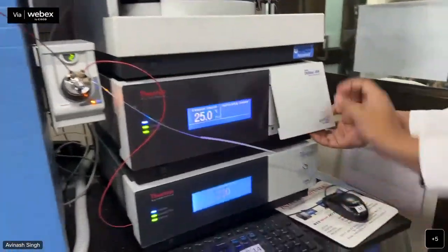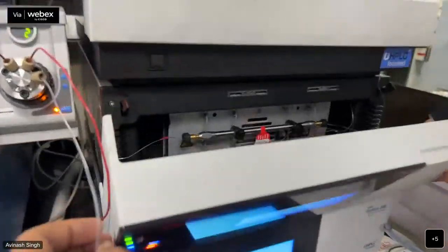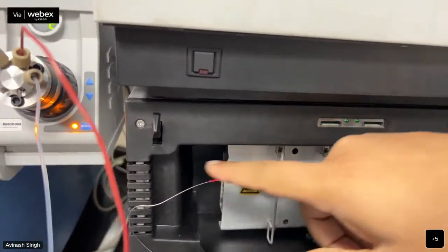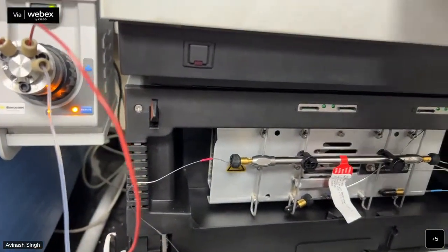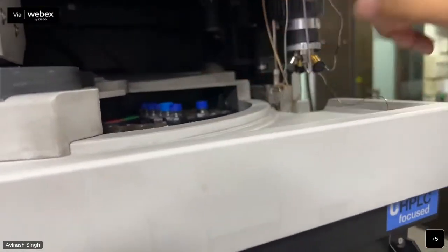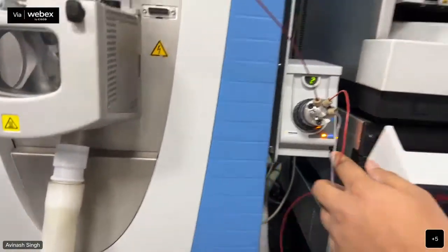So here you can see the column, the analytical column, where the sample is passing. All the sample is passing through this compartment and then going through the tubing to the next compartment. There are different tubings which take the sample from these vials, and from this tubing it goes to the column, and from the column it goes to the instrument.